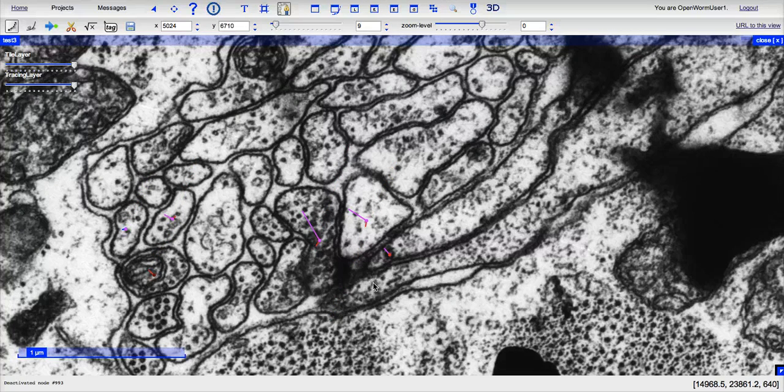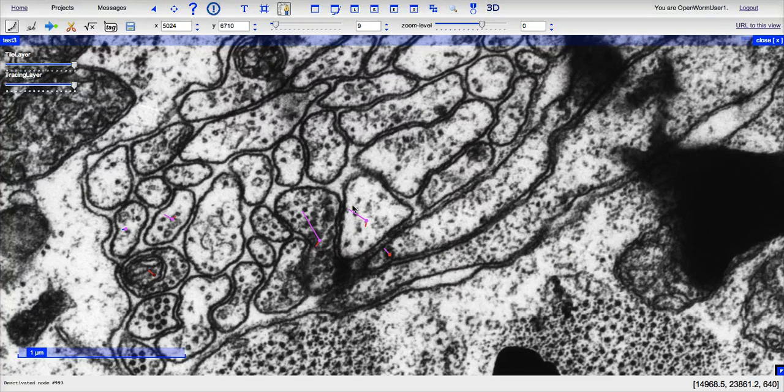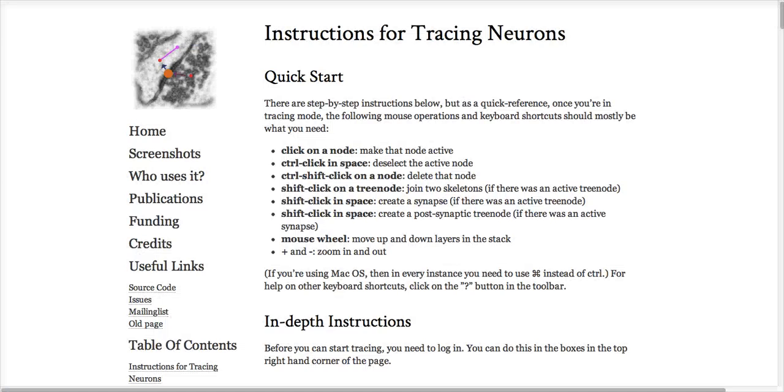Once you've identified what you believe is a presynaptic cell, a postsynaptic cell, it's time to actually mark the synapse. For a quick moment, I'm going to go over to what it says for tracing neurons.